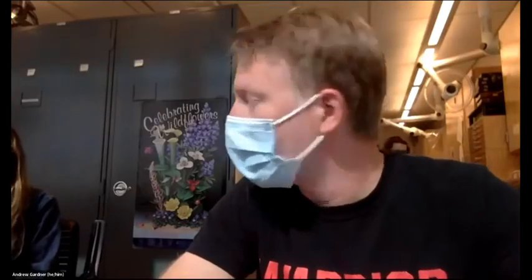While you're maybe finishing up your specimen, I'll explain a little bit about how we use them as scientists. I mentioned earlier, and we were showing you these other collections, how they have labels on them. The labels are really important for us as scientists because they give us a lot of other information about that specimen.